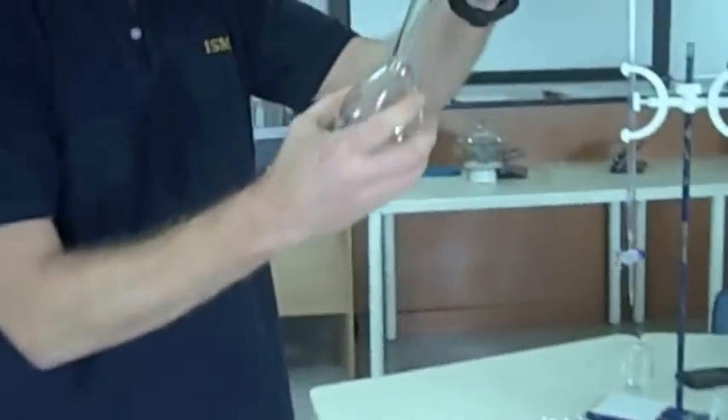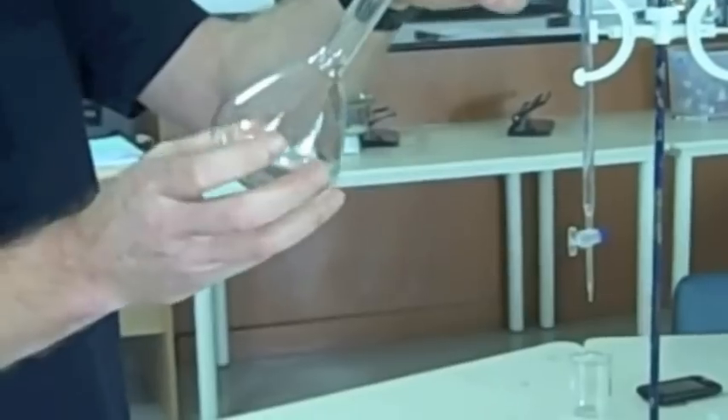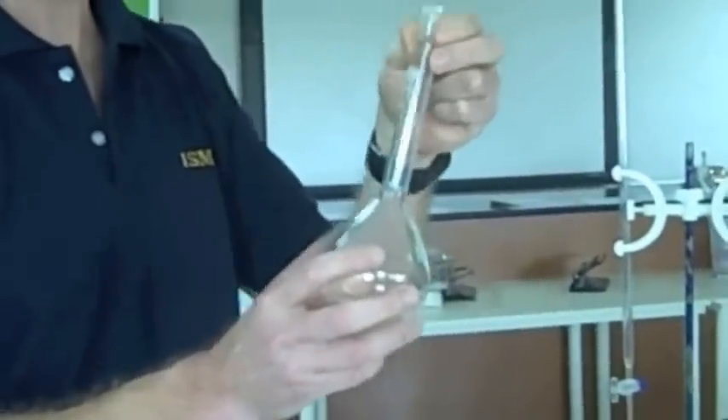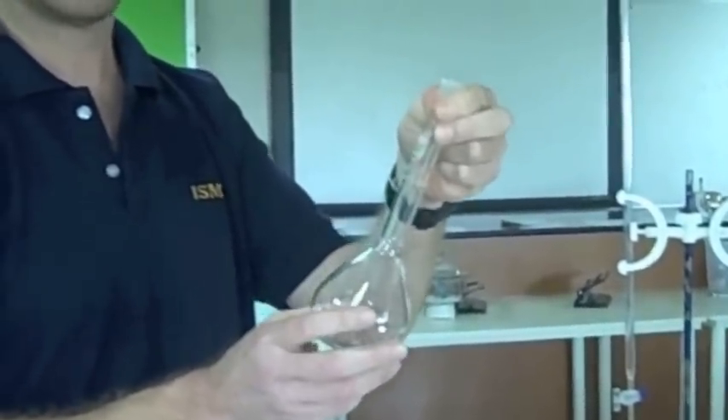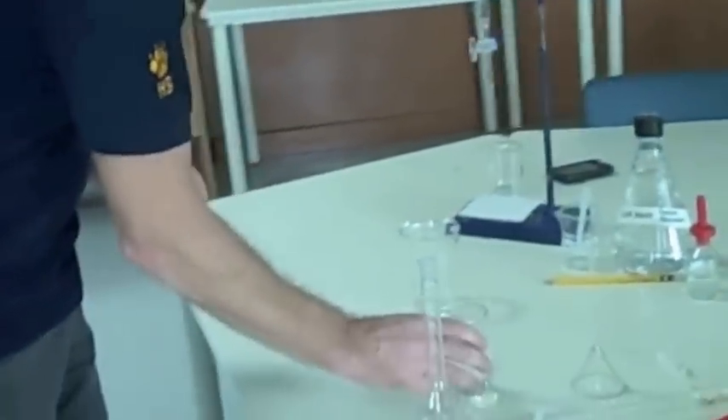Then you take your volumetric flask. Now these devices have a very precise and accurately known volume. This is 250 millilitres. If we use this properly, we can measure 250.0 millilitres, or 250.0 cc's. So the first thing I'm going to do is transfer this into here using a funnel — a long stem funnel. This should be cleaned.